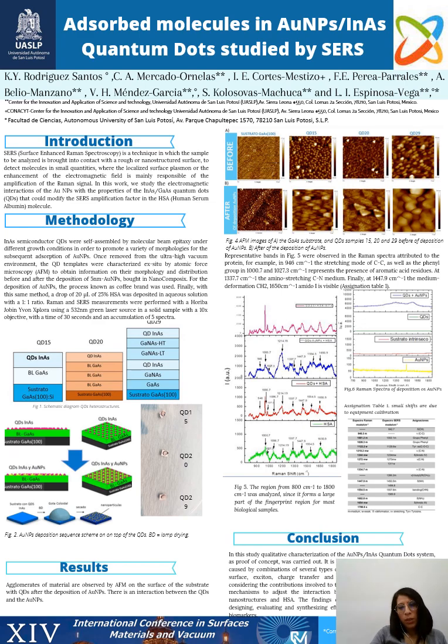In picture 4, we can see the samples by AFM before and after the deposition of nanoparticles. We can see little accumulations or agglomerations of the material after the deposition of the gold nanoparticles.